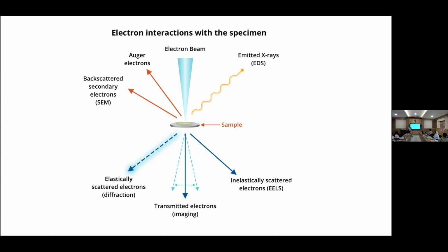What is happening is just projection. You know the projector: if we place a film there, then we will get a magnified image on the screen. That is a projection. Another comparison is our medical X-ray. So how are we getting our skeleton image in X-rays, how does it happen?